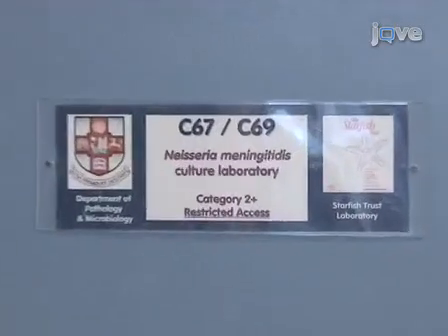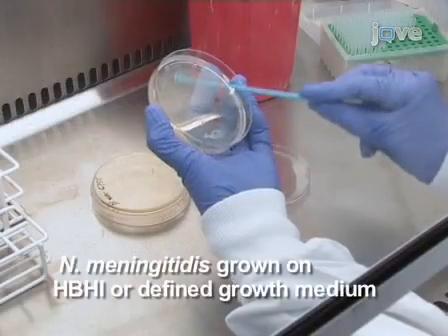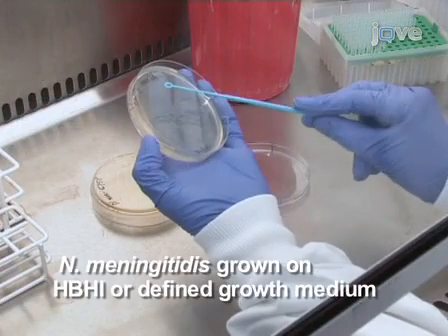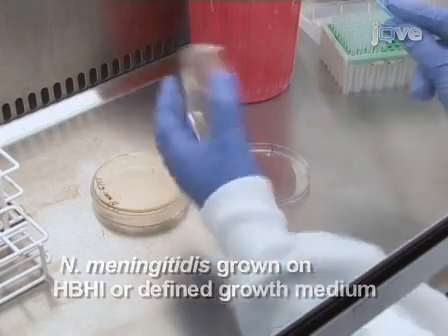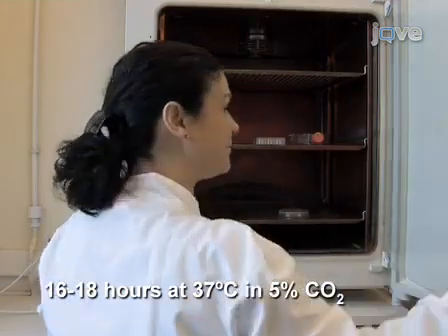This work needs to be done in an adequate safety laboratory. 2 days prior to the immunostaining procedure, inoculate the bacterial strain of interest on brain-heart infusion agar plates supplemented with 10% heated horse blood. Grow overnight at 37 degrees Celsius in a 5% carbon dioxide atmosphere.